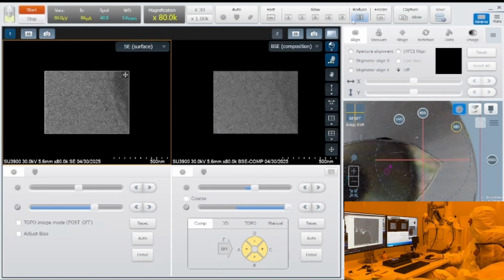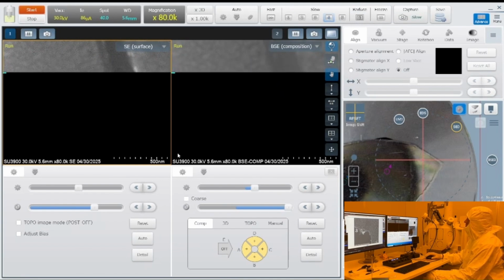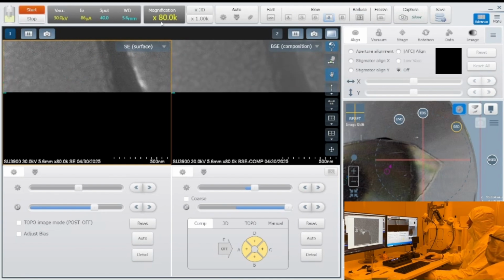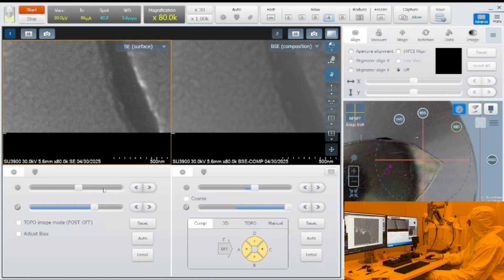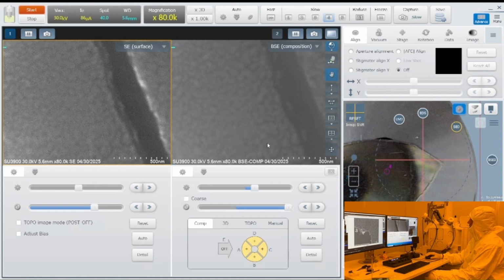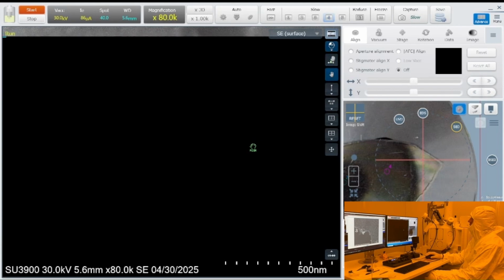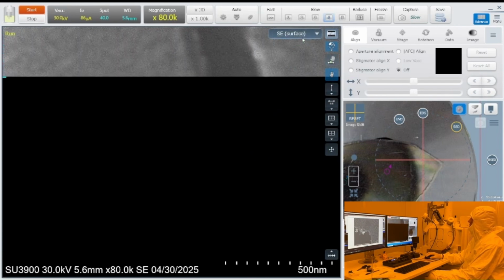So here maybe we have a grating and then you have silver, right? And silicon. Yep. So yeah, this sample, 80,000 now, and look how small these are. This is 70, and these are big, right? Really? So I'm over here now. Look how small these are. Yeah, it's still small. Is that a surface?